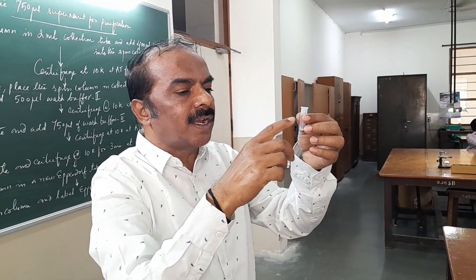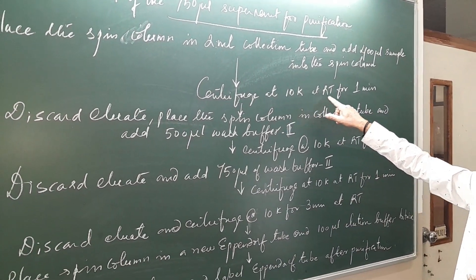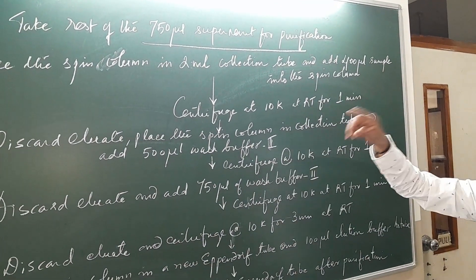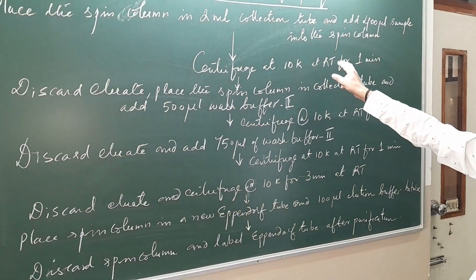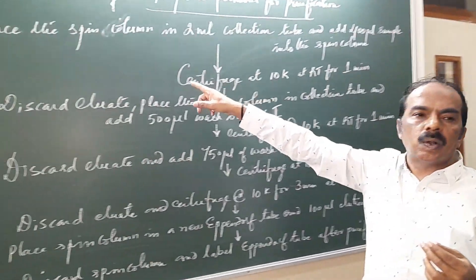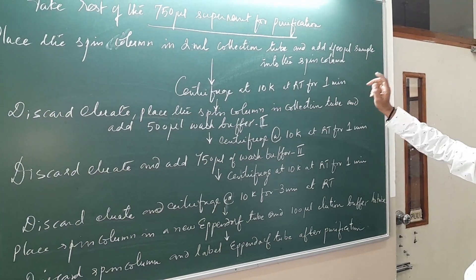Centrifuge at 10,000 rpm at room temperature for 1 minute, adding 400 µL of the sample. So we already took 100 µL for the crude sample, and from the remaining supernatant we take 400 µL, put it in the spin column, and keep it inside the collection tube. Centrifuge at 10,000 rpm at room temperature for 1 minute.